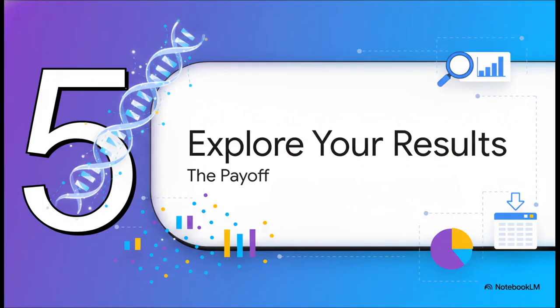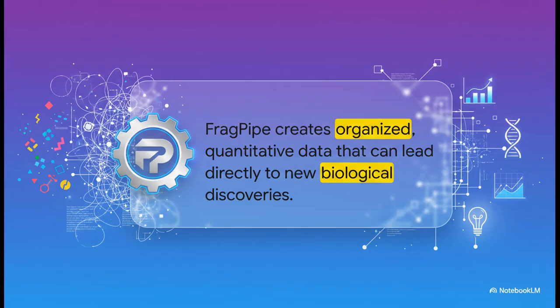Okay, after all of that setup and all that processing, we finally get to the best part, the payoff. It's time to explore the results and see what kind of data FragPipe has for us. Because that's the whole point of all this, isn't it? We're not just trying to make tables full of numbers. We're trying to get to organized, quantitative data that can lead us to some exciting new discoveries.